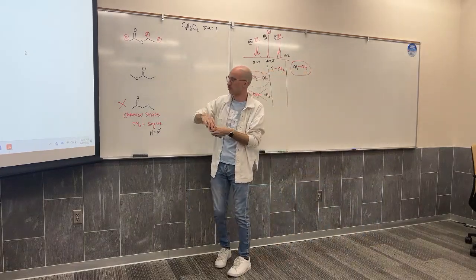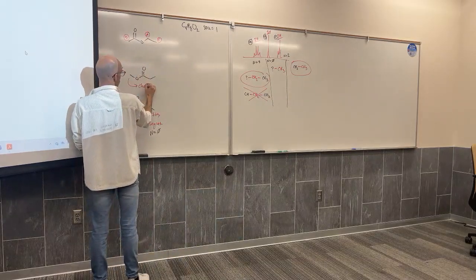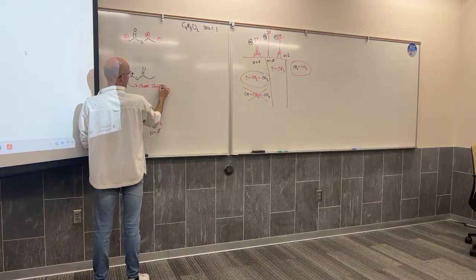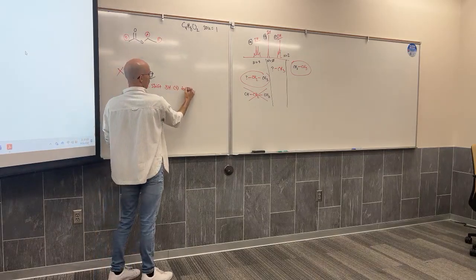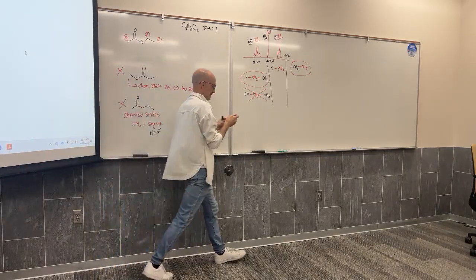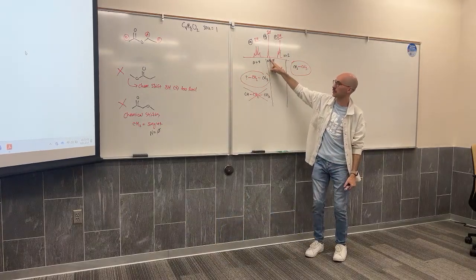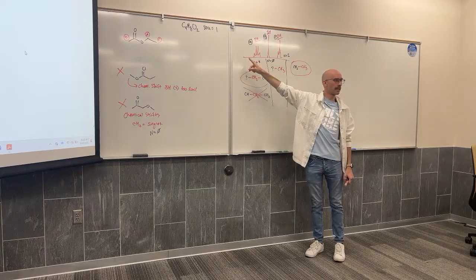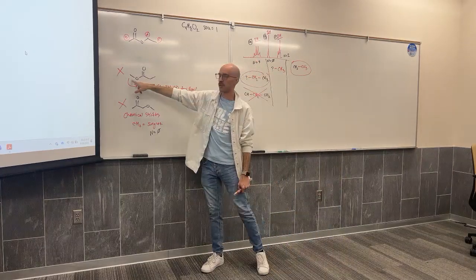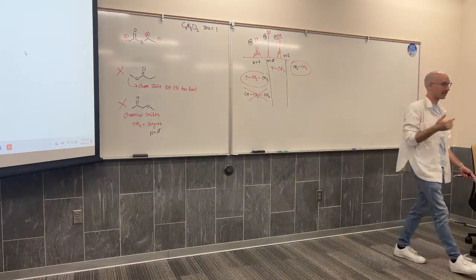This compound doesn't work because the chemical shift for the 3H singlet is too low. If that singlet CH3 was closer to 4, that would be where I'd expect it to show up for this molecule. So the chemical shift is the only thing that we can actually use there to separate them.